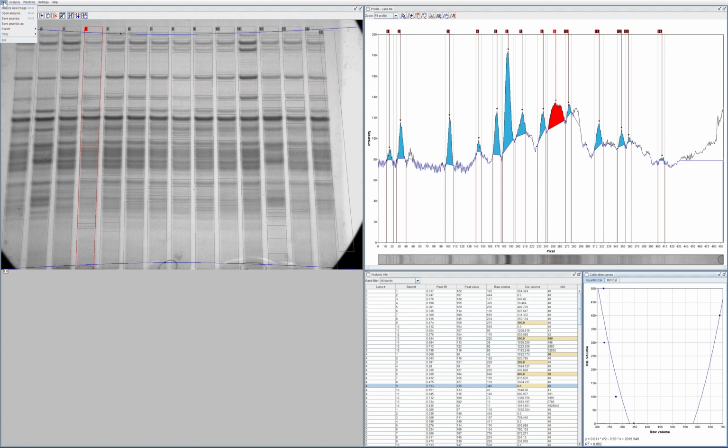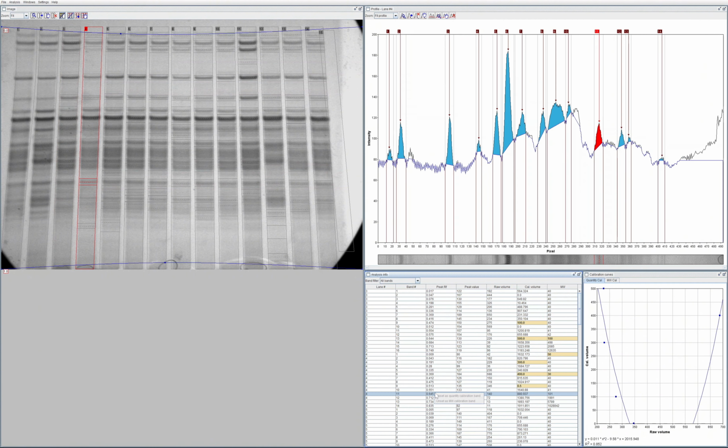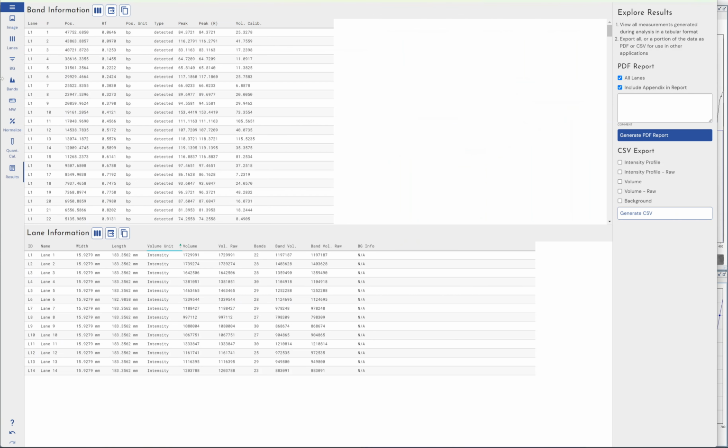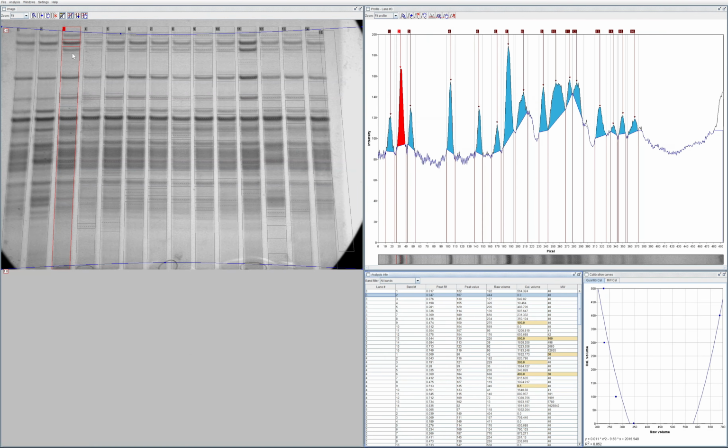I don't know. So you can export different sections of information. I don't know if you can export this particular information, although maybe you can copy and paste it, but you don't seem to be able to just one-click export to CSV or export to your clipboard if possible. But certainly there doesn't seem to be any formalized PDF report that you can export from GelAnalyzer.